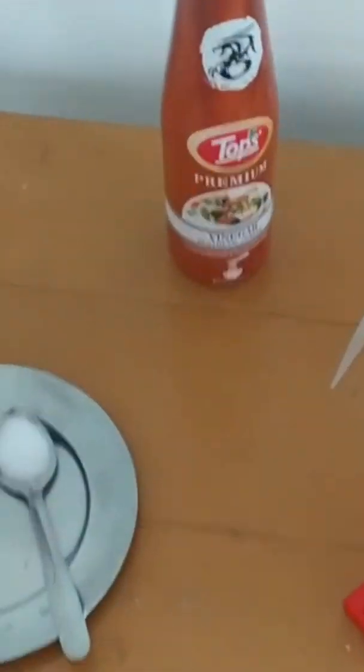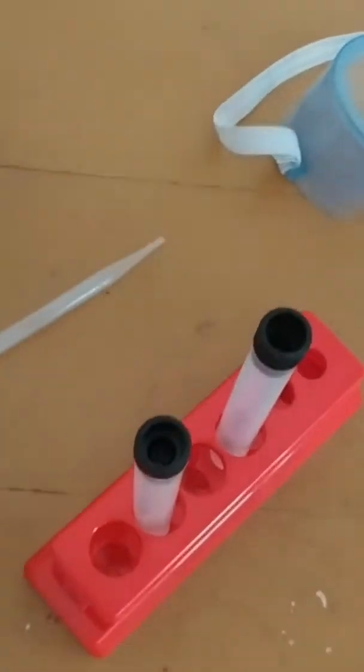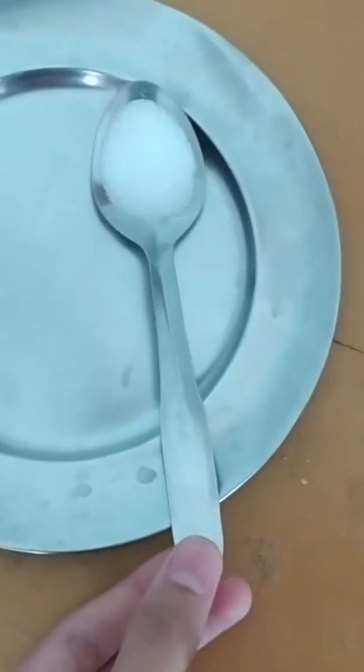For this experiment, we need vinegar which is used in normal houses and a dropper, this one, and a test tube with a test tube holder. We also need one fourth spoon of salt. After salt, we have goggles.